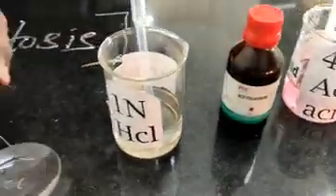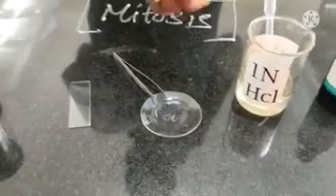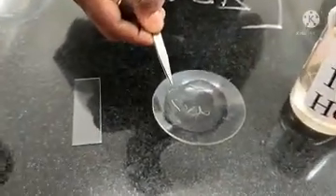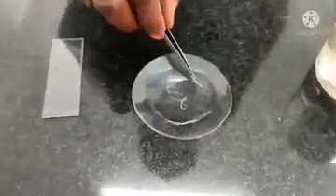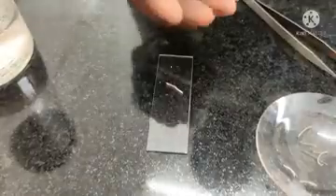Here, to the onion root tip you have to add 1 or 2 drops of 1 normal HCl. Then you have to heat it for 1 or 2 seconds. Then the onion root tip is taken and placed on the slide, and you add 1 or 2 drops of acetocarmine stain. Then leave it for 30 minutes. After that, remove the excess stain.